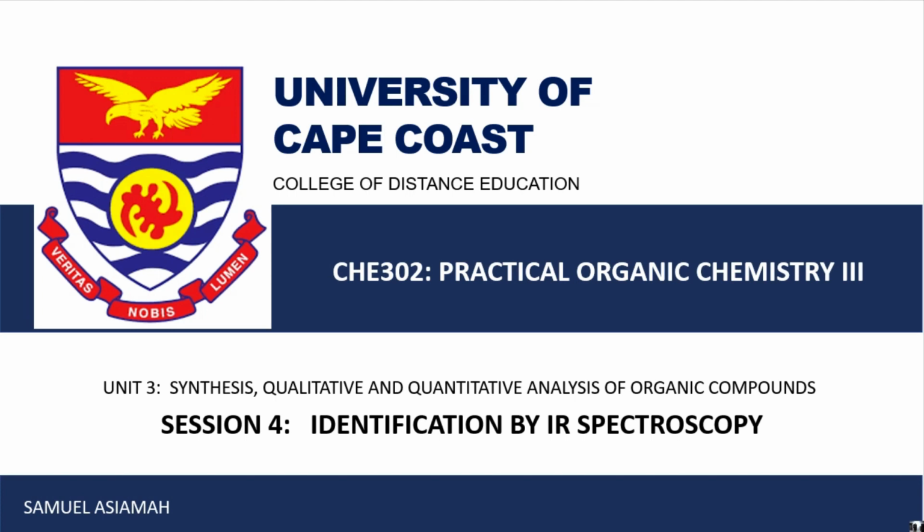Everyone, and you are welcome to the fourth session under Unit 3. So, in this session, we are going to look at the identification of organic compounds by IR spectroscopy.